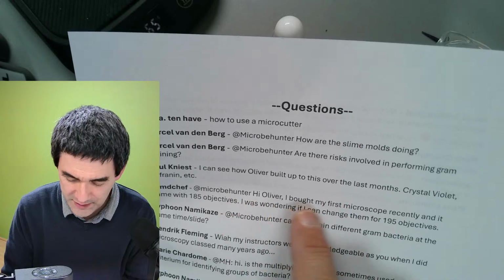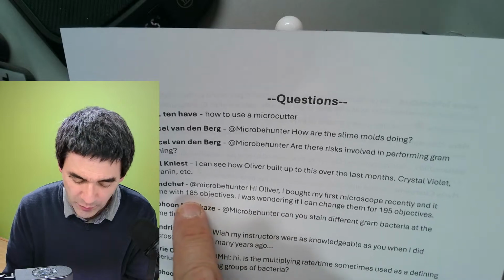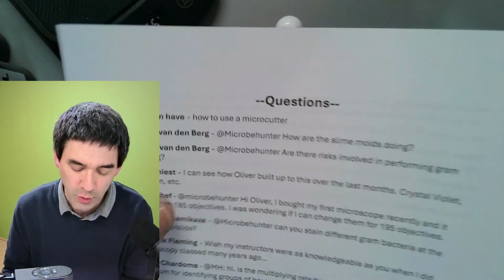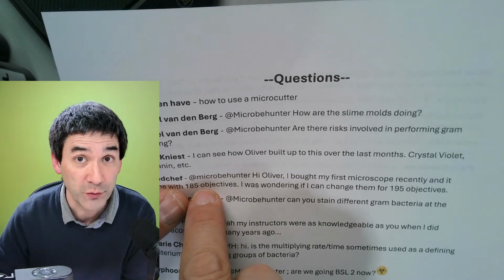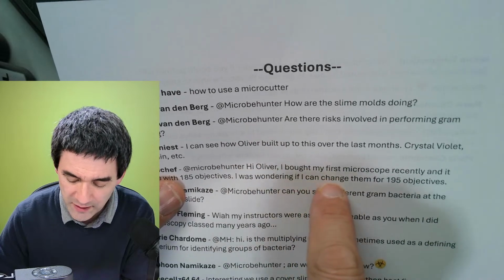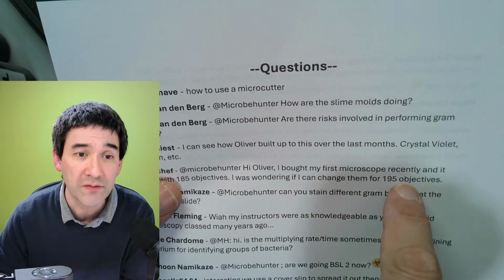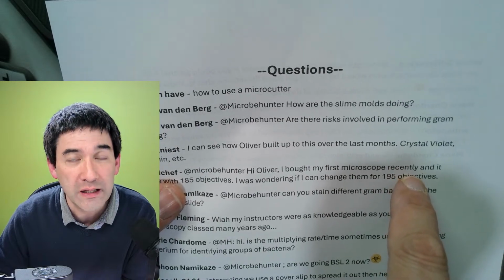I bought my first microscope recently and it came with 185 objectives. These are the short barrel objectives. Many traditional microscopes, for example my old Olympus microscopes, also had a 185. I was wondering if I can exchange them for 195 objectives. Only if you have enough space.